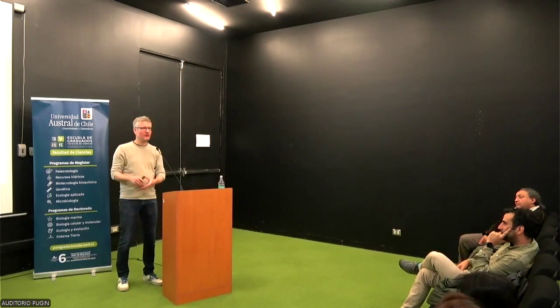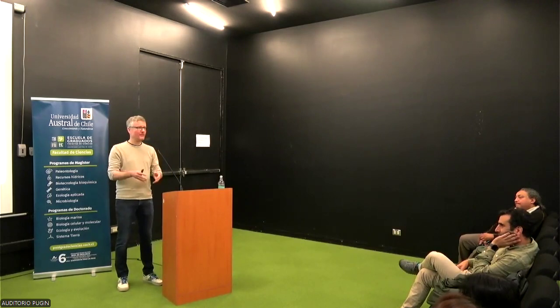That's true. So when it comes to reproducibility, first of all, coming to the models that are used in our AI technology, most of the models that we use, we of course adjust them to our systems, but they are coming from the Google Foundation or from the Google company.